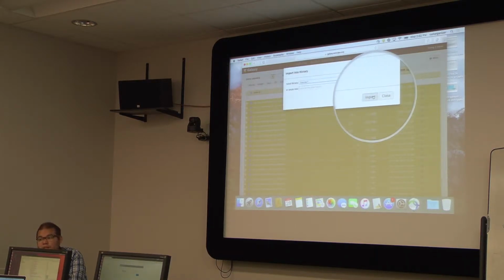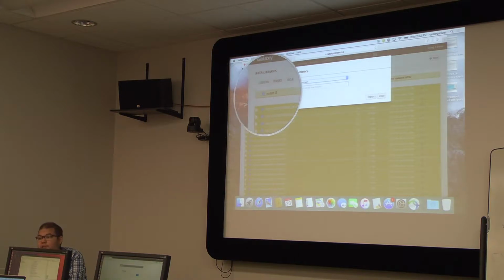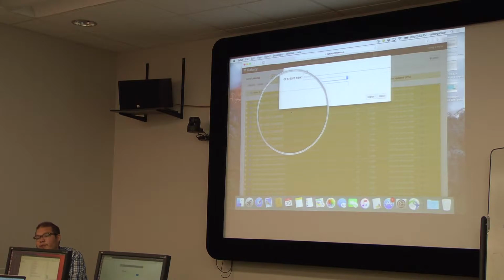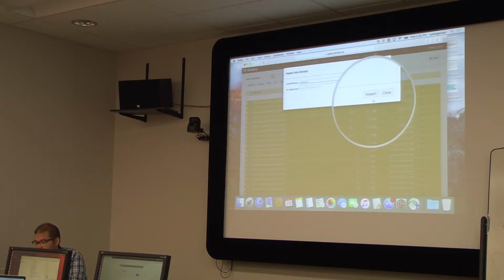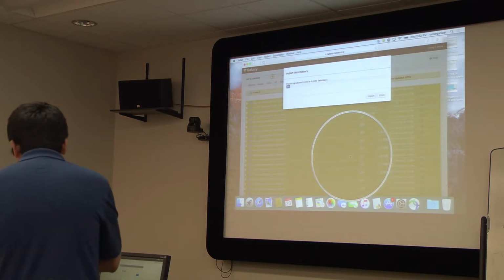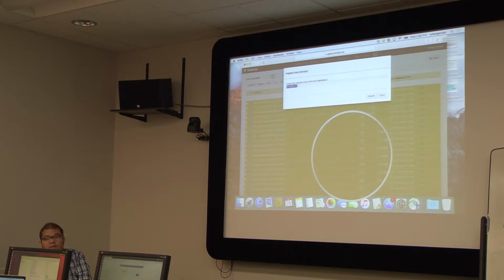But how do you select them all? Just like, here, see here? Oh, okay. Name? Yep. But you need to make sure to have all 50 images there. If you don't have them, you have to go through each page. Okay, so I'm going to click import, and it's going to import the images into my history. Okay, so I'm just going to wait a little bit.